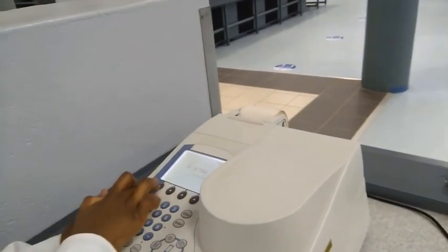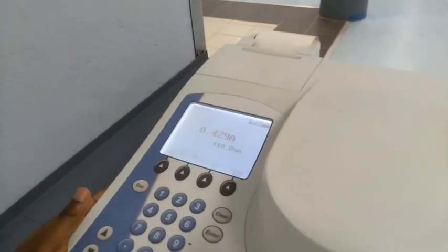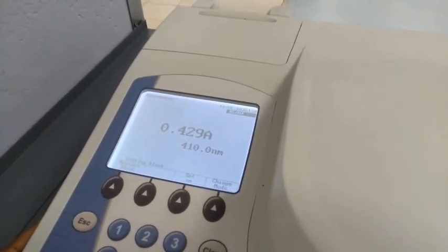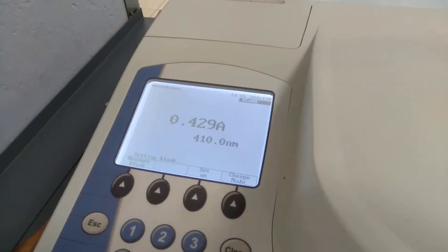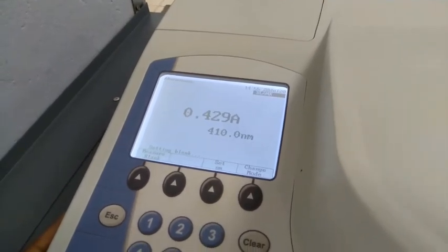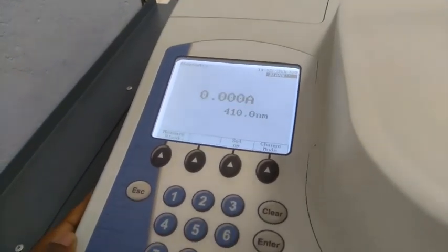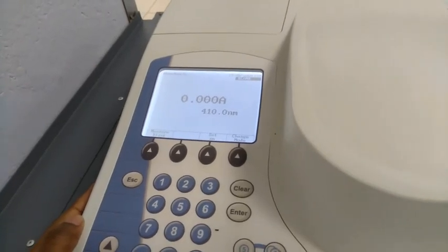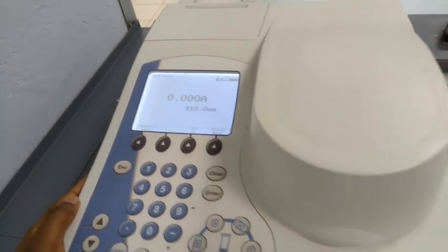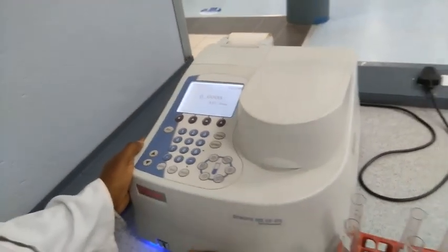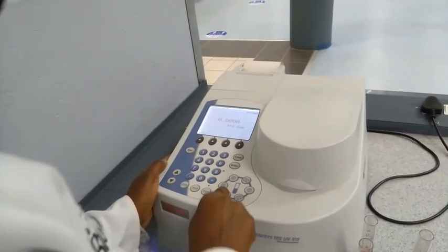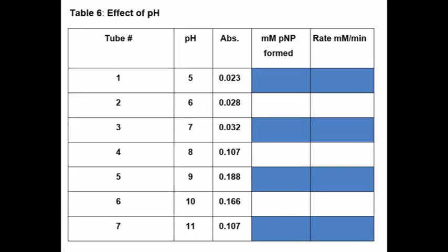We are now blanking for tube number one. The spectrophotometer should go to zero — and there we go, at zero — which is our tube number one without the enzyme. And then we'll be able to measure the absorbance of the enzyme-containing tube.